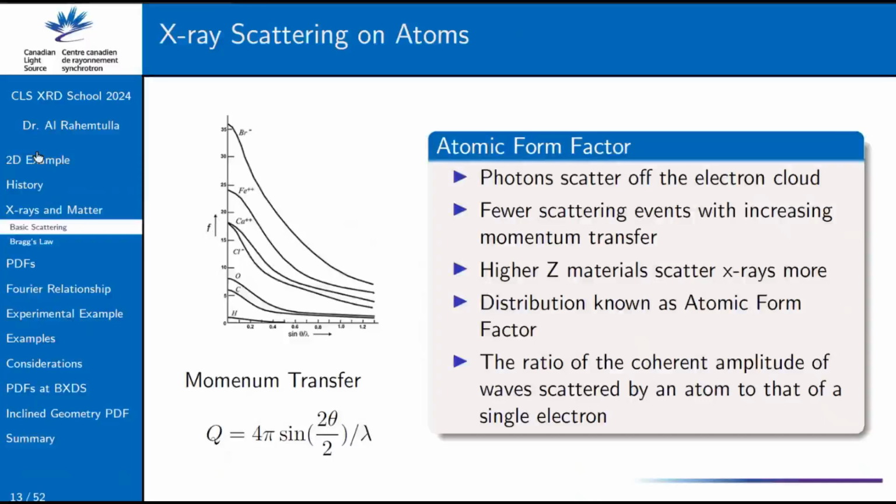So this would be if we were to do a scattering measurement and, instead of having an actual material or a structure, we just scattered off of a single ion or atom. This would be the sort of structure that we'd see. We just see this fall off and we'd have these weird curves that tell us a little bit about the orbital structure.